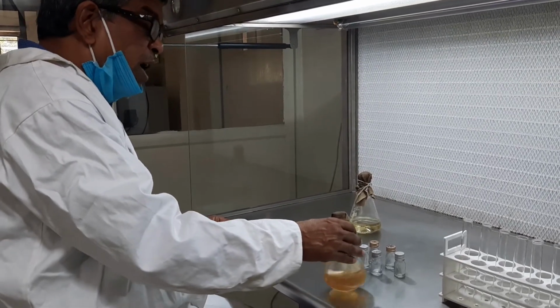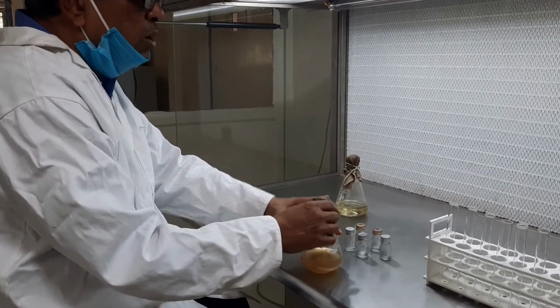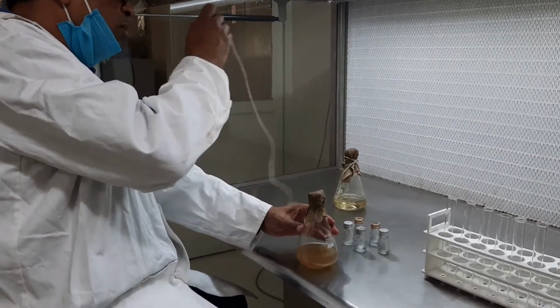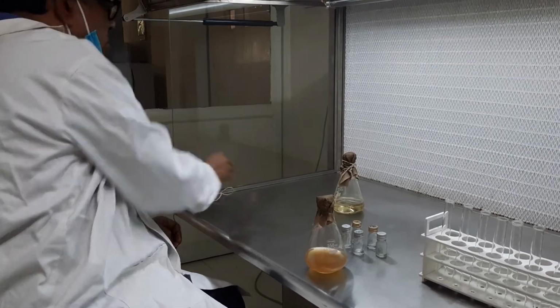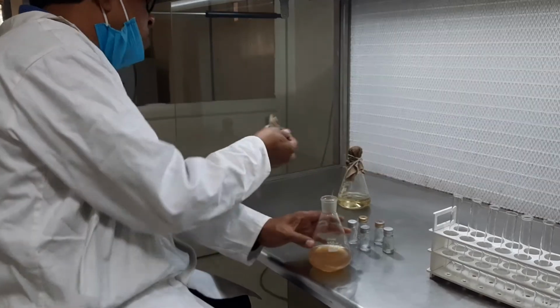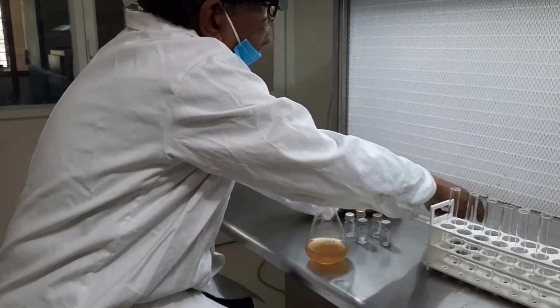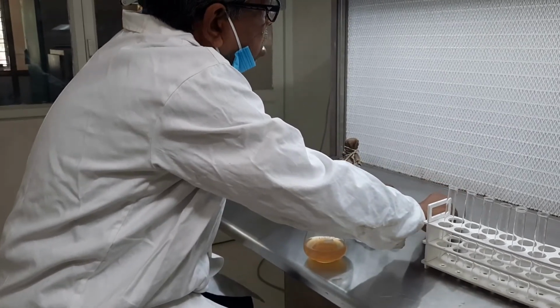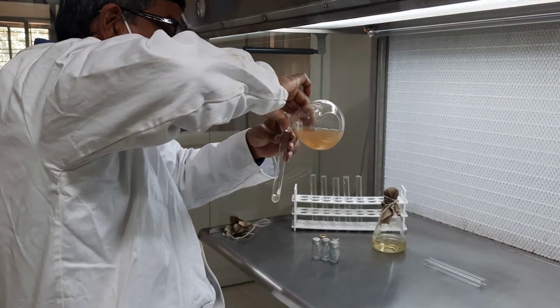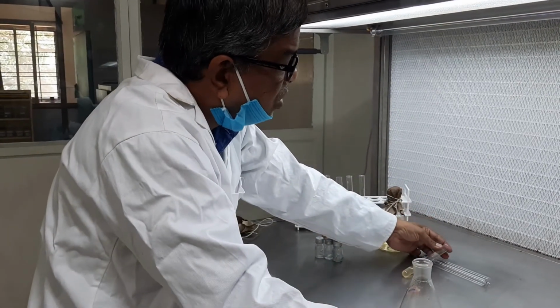Before it gets solidified, I am experimenting with solid media first. So this is how to open. It should be discarded. The solid media is given, and I am keeping it slantwise.